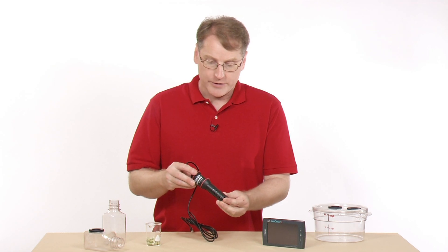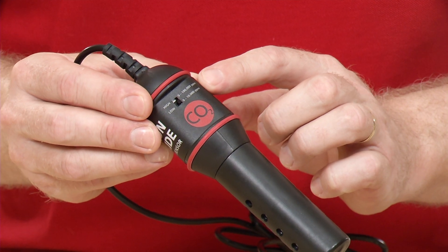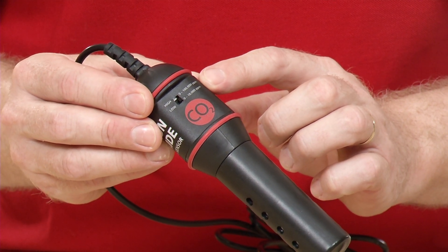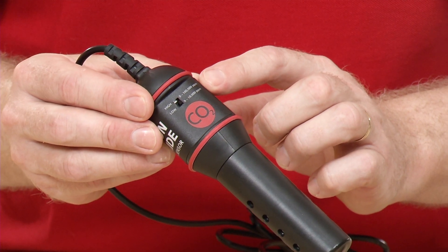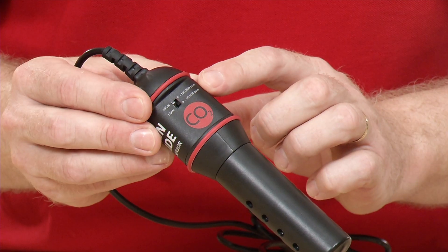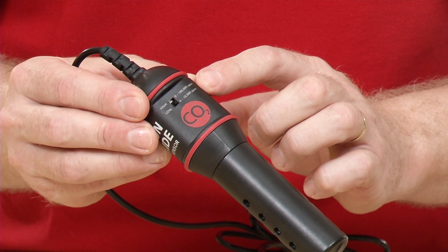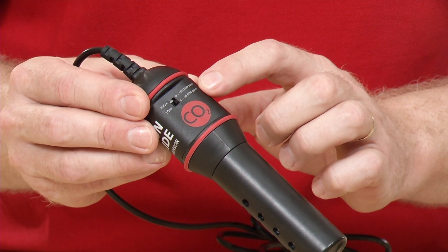This is a dual range sensor, and there's a sensor setting switch — a sensitivity switch. The low range is 0 to 10,000 parts per million, and a lot of experiments will use that. The higher range is 0 to 100,000 parts per million, which you might need if you're going to breathe on it or something like that.